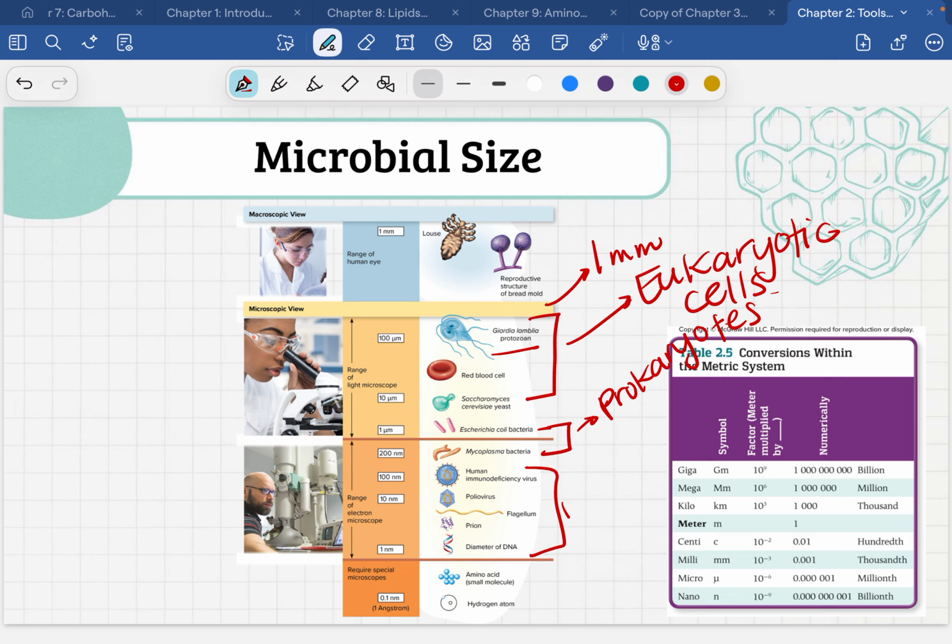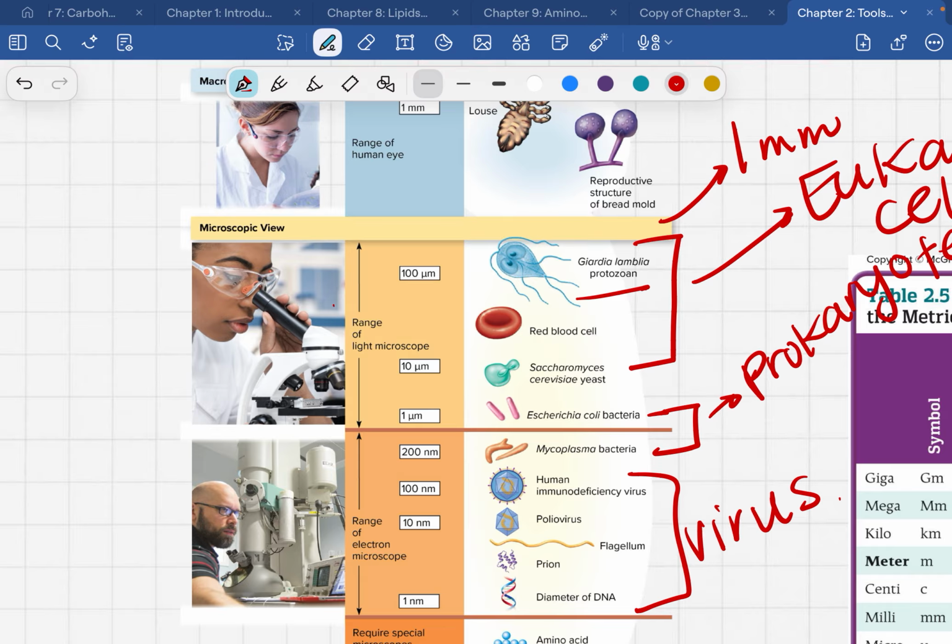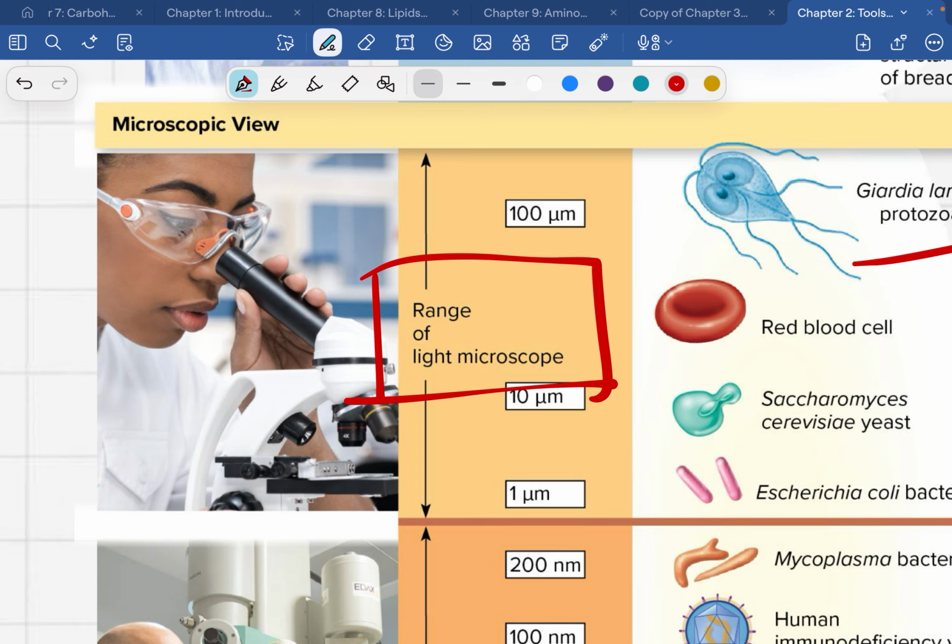So it's important to note that there are a lot of different types of microscopes. The main microscope that we are going to be talking about, and the most common in microbiology and specifically in college, is a light microscope. So the microscopes that you have seen, most likely, the regular kind of microscope that you've probably used in high school biology class or whatever else, or if you've been to micro lab for this class, those are the kind of microscopes that you are probably familiar with. And they are called light microscopes. Light microscopes are the most common type. They're called light microscopes because they use light.